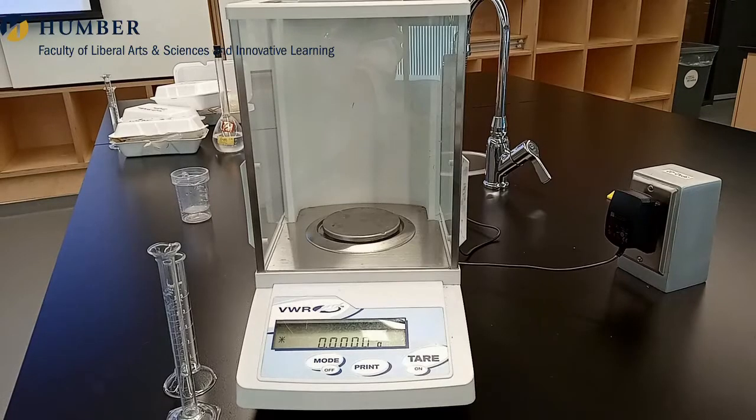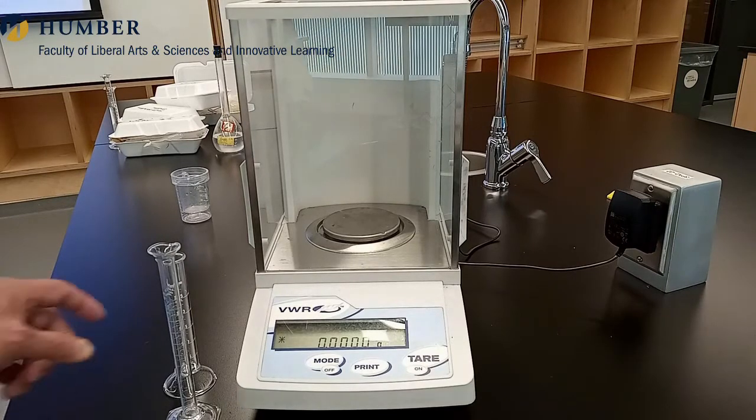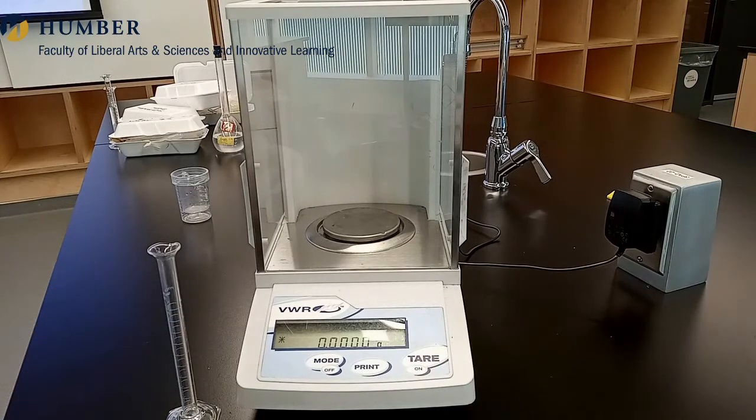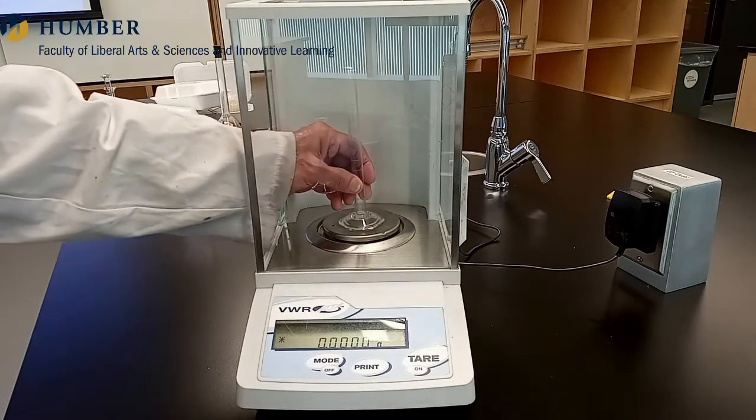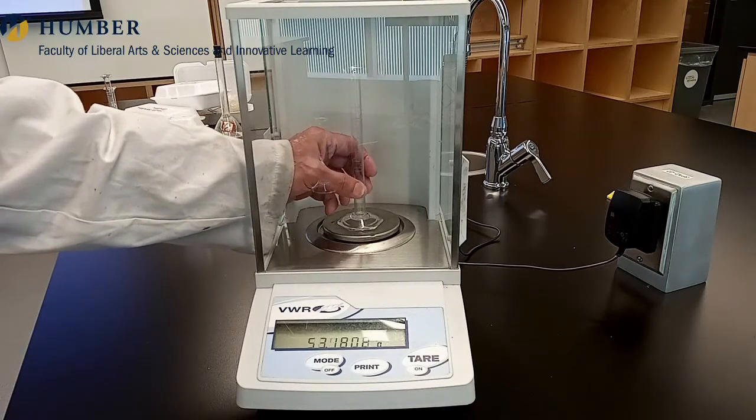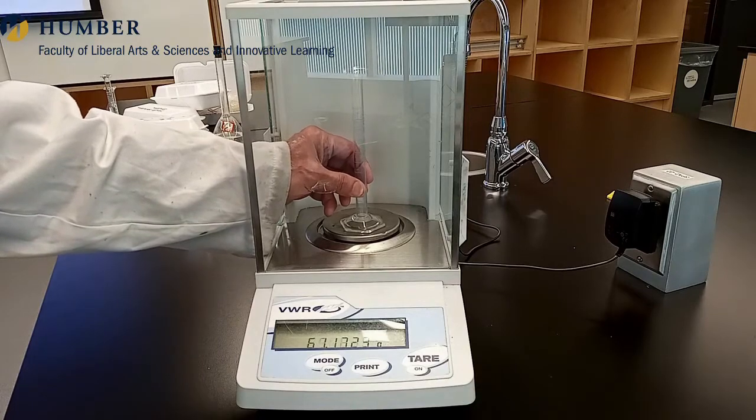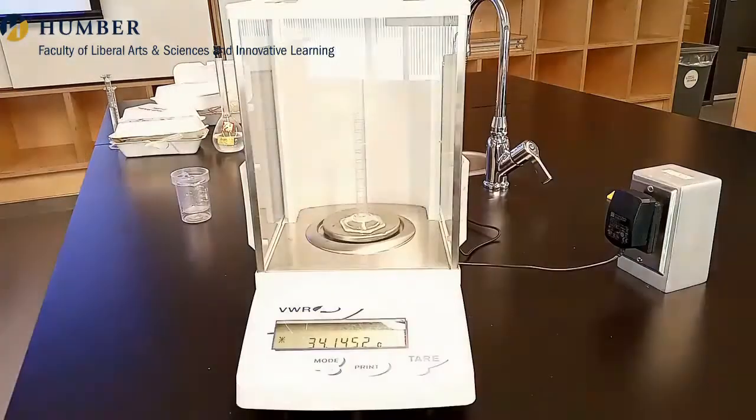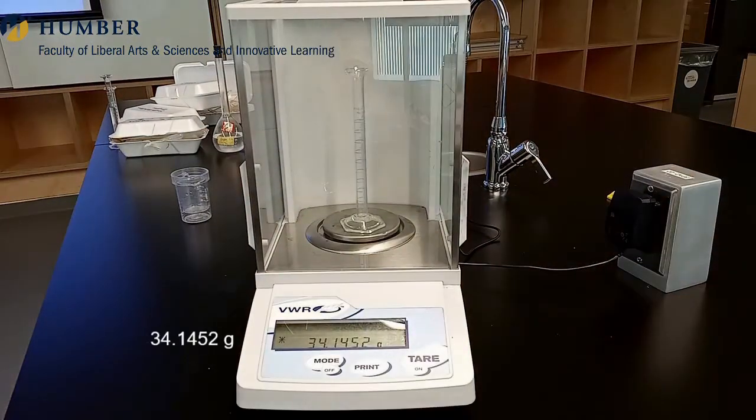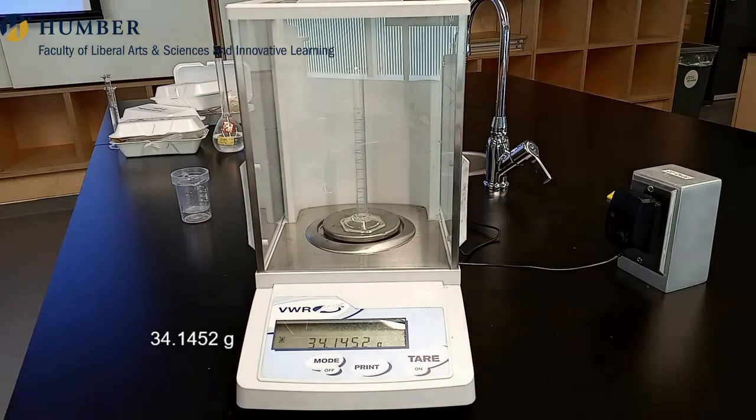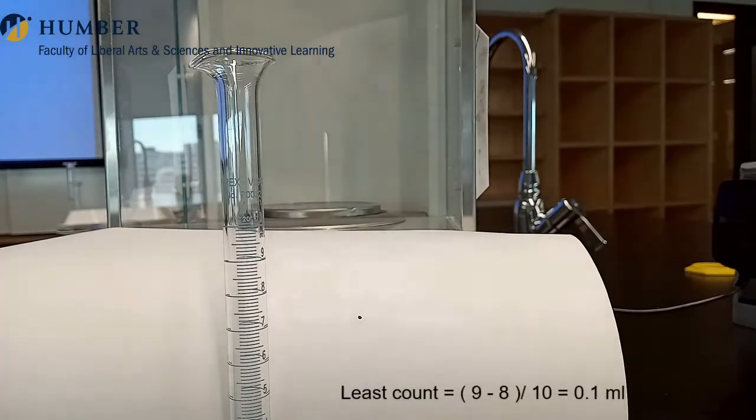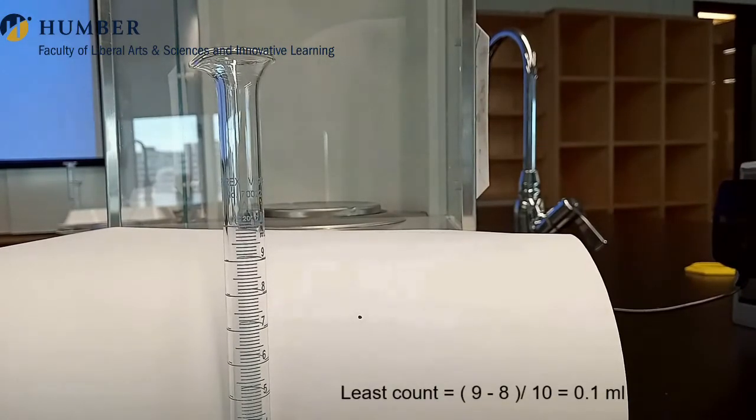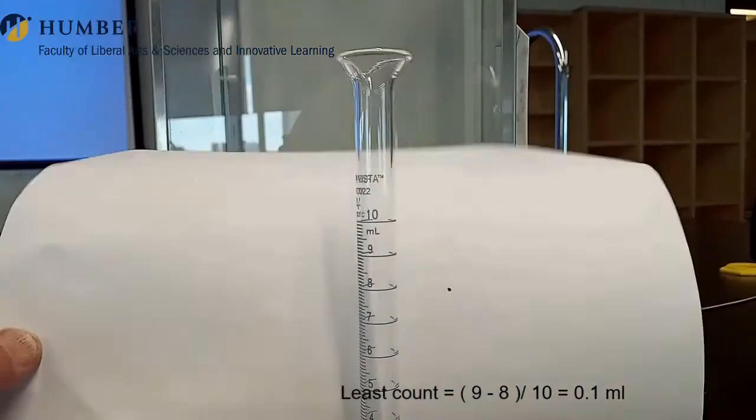Weigh an empty 10 ml measuring cylinder on the analytical balance. Record this mass of the empty cylinder as m1 for all samples. Determine the least count of the cylinder. If necessary, refer to my earlier video.